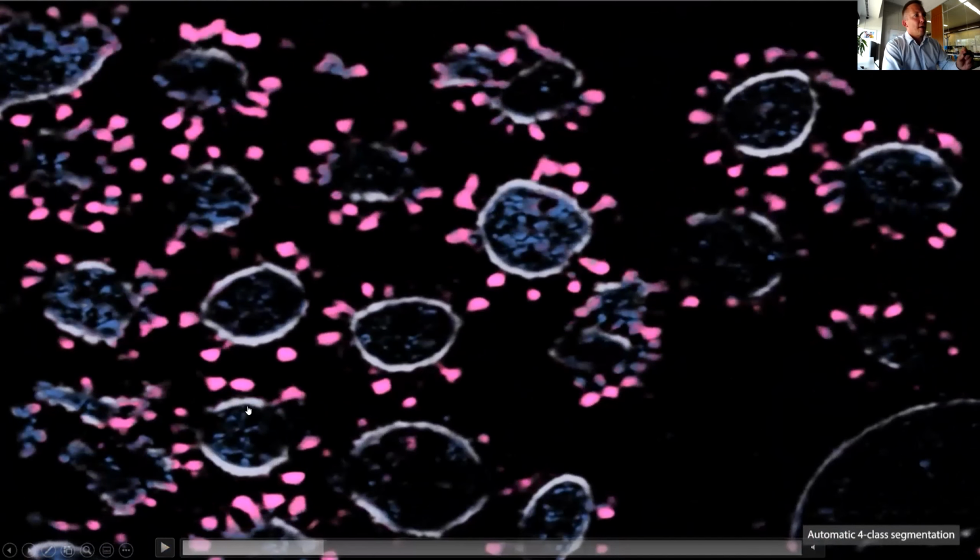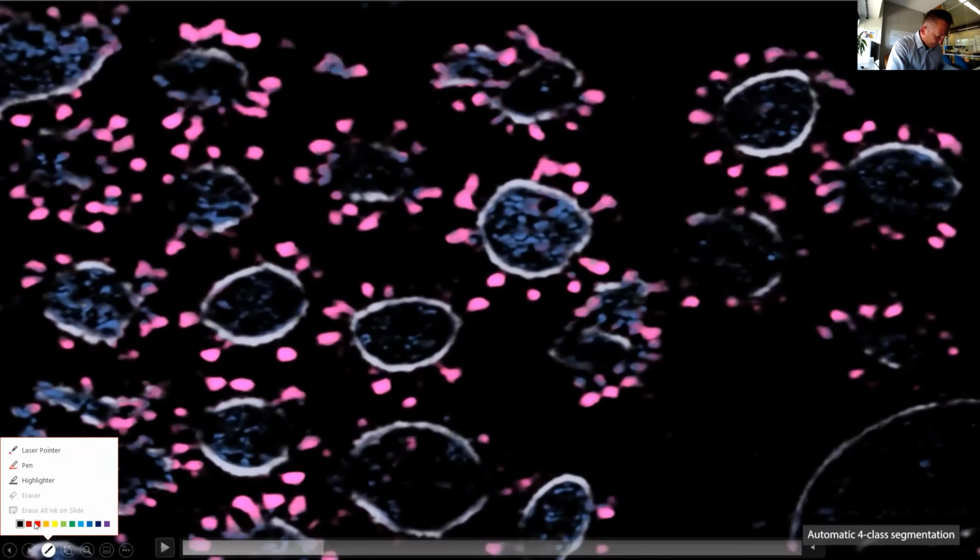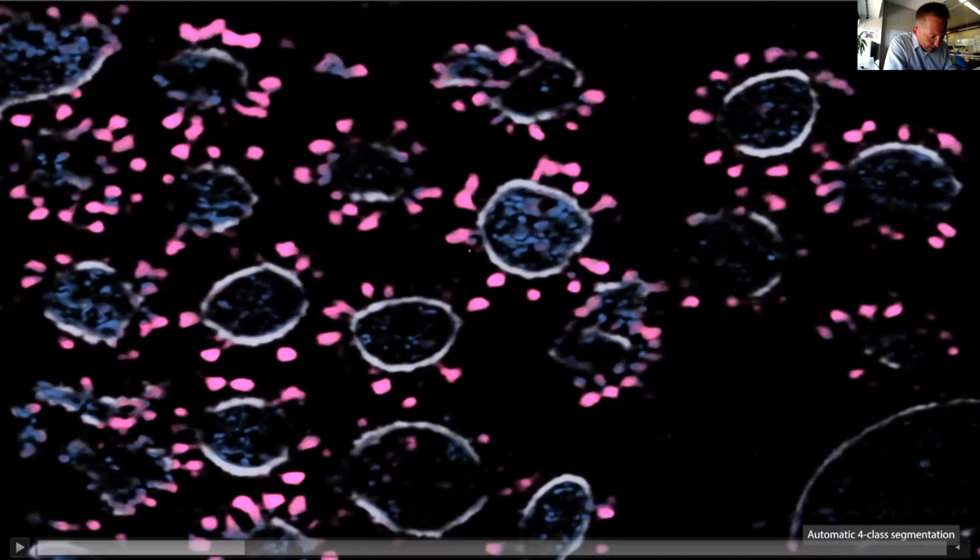You would see that in some areas, like here, the envelope would often be open, so there would be no envelope segmentation here or here, like it would look here, for example. But with our deep learning approach, the inference actually results in much better handling of the missing wedge problem. These viral particles often look open in these areas. That's actually the missing wedge artifact.